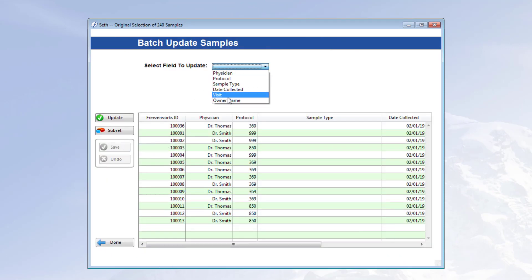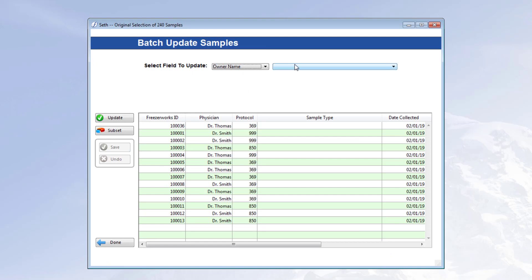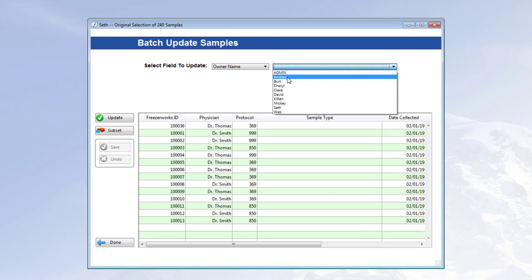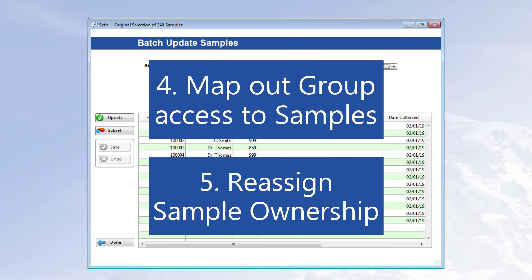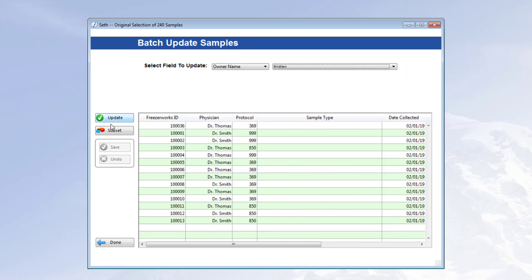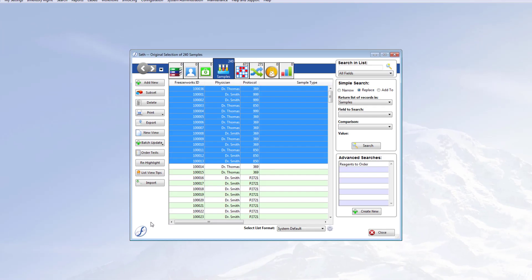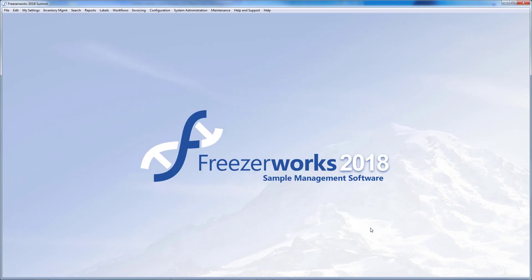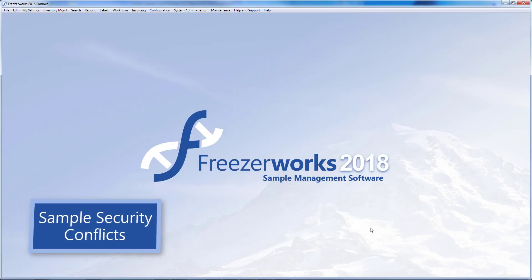The first three steps should already be quite familiar to you if you've upgraded before. But it's these last two that are exclusive to the 2019 upgrade and what we'll be discussing in detail today. By far, the most widespread change we've made in 2019 is to sample security.